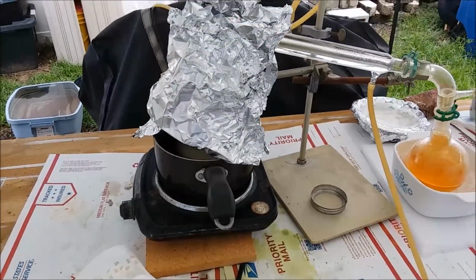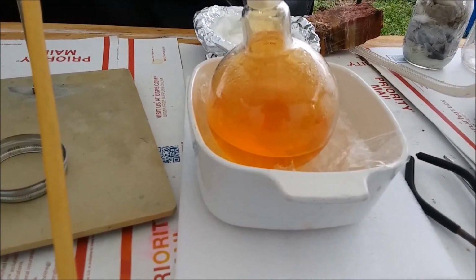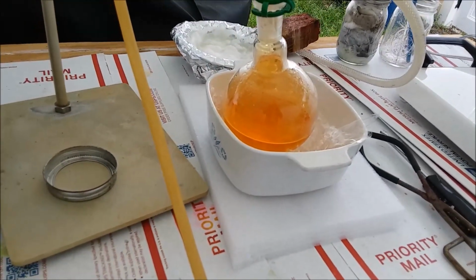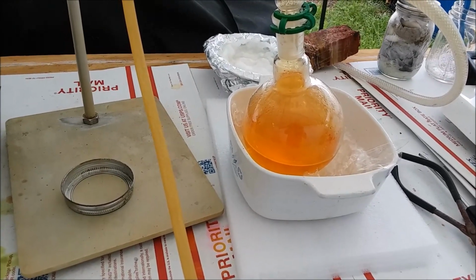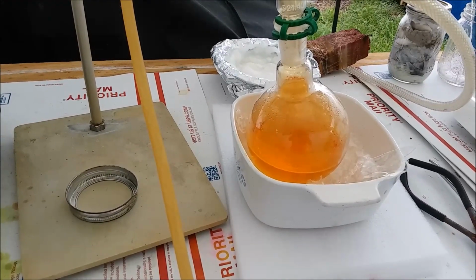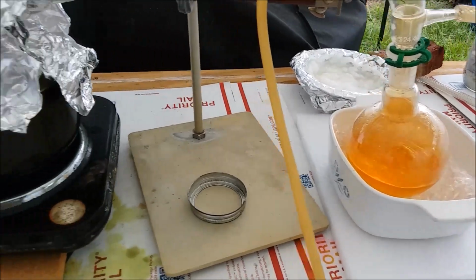So this went pretty well. It looks like I've got a lot of liquid in there. But I know from experience, don't count your nitric acid liters before you measure them. But I'm expecting to get about roughly 2.5 times as much as I normally get. We'll see. So instead of about 100 milliliters, it should be maybe 250 milliliters. Maybe a little more, because I'm running this a little longer than usual. We'll see.